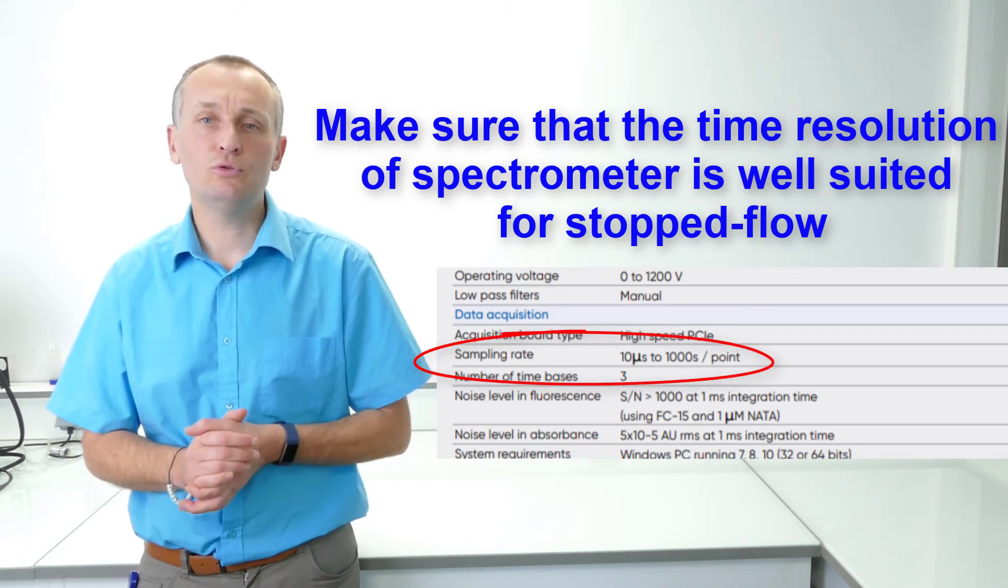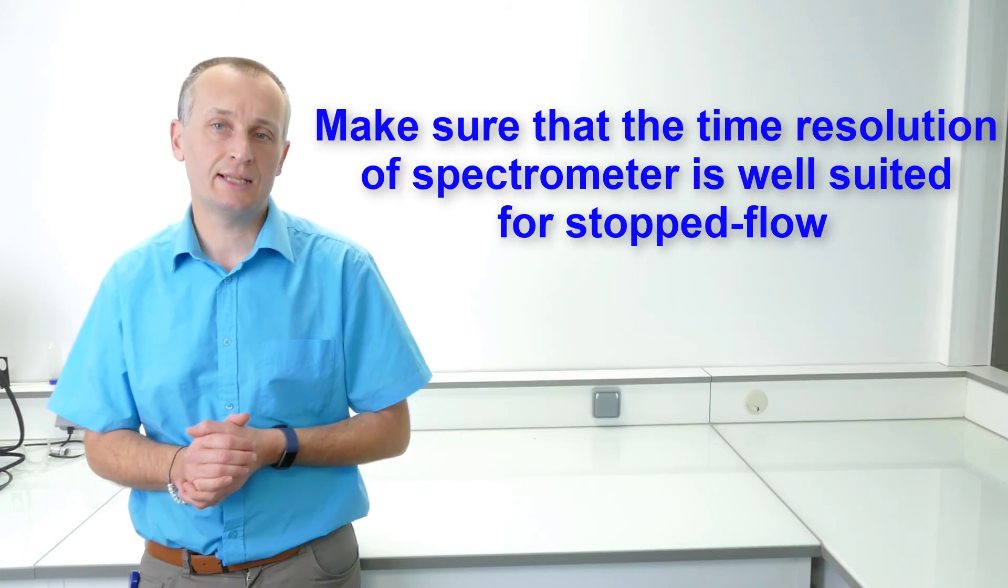For example, if your stop flow has a 0.2 ms dead time, but you collect data every 10 ms, then the effective dead time will be 10 ms.